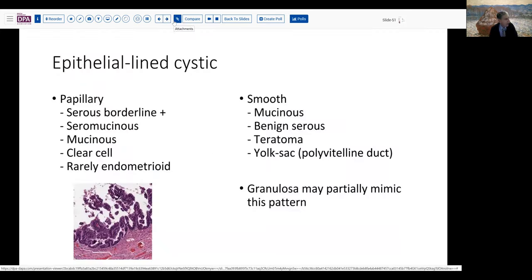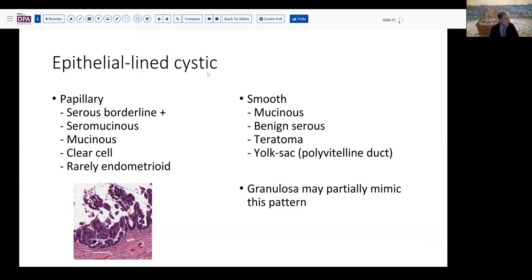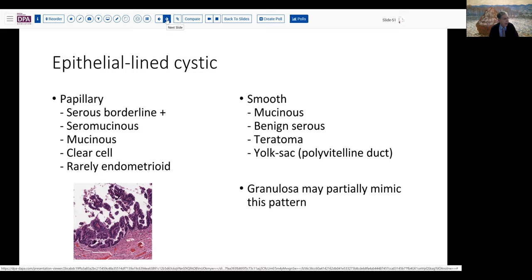Epithelial-lined cystic tumors include papillary tumors — serous borderline or serous carcinomas, seromucinous tumors, mucinous tumors. Clear cell carcinoma can occasionally have this pattern, and some endometrioid tumors as well. If the surfaces are very smooth you'd want to think about mucinous tumors or benign serous tumors. On the other hand, if they're very irregular and ragged you're going to be thinking more of the borderline tumors. Some yolk sac patterns and granulosa cell tumors can also have a sort of epithelial-lined cystic-like macro-follicular pattern, although the lining will be attenuated to variably several cell layers thick.